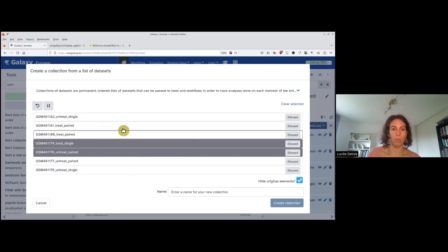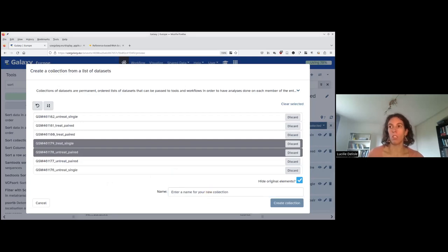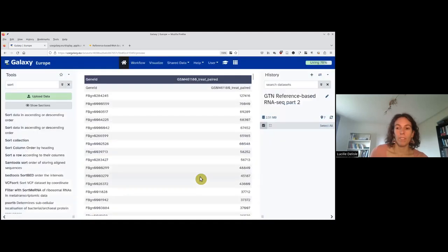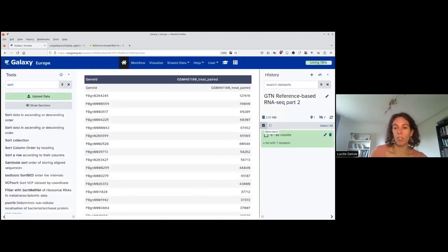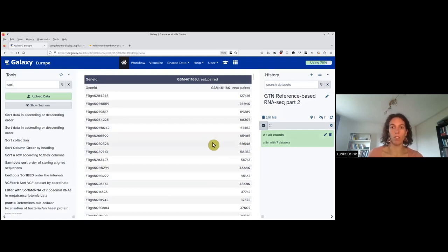Now we have all seven, and we will give a name to this collection. We can call it 'all counts.' I leave the checkbox mode by clicking on the checkbox. Now I have one dataset, which is a list of seven datasets called 'all counts.' I come back to the tutorial as I will do a bit of theory.